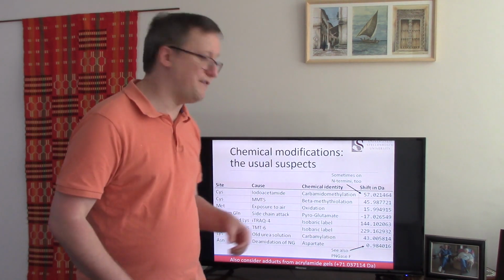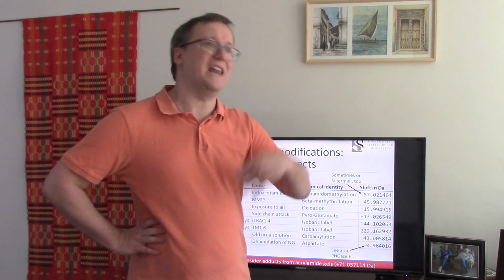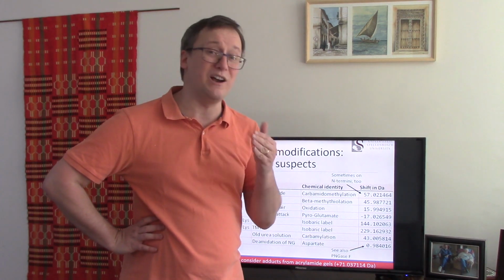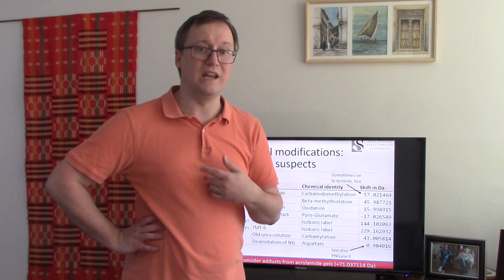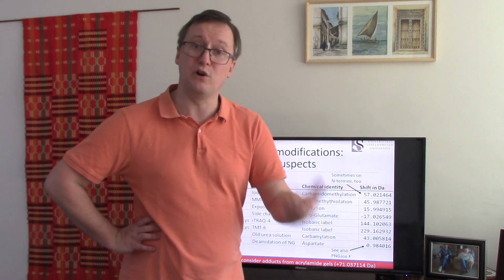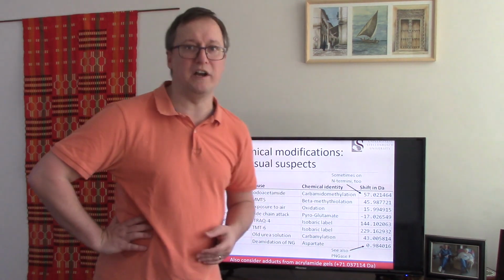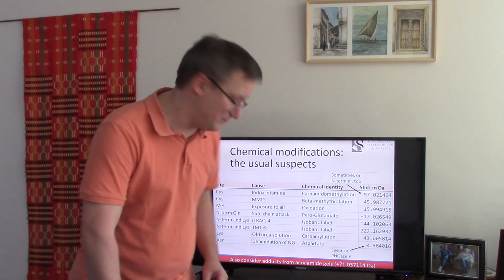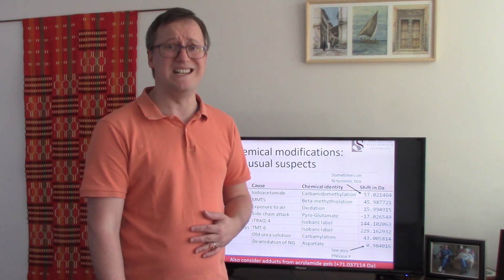So every time we modify a lysine, we should remember that we may not just be adding mass to the lysines, we may also be blocking that lysine from participating in a peptide cleavage event. So your protease, trypsin, may not chop after a lysine if it's been modified in particular ways. That's a big deal.